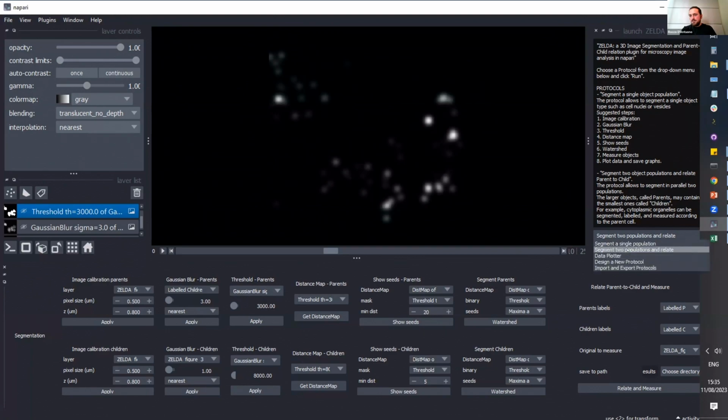So it's not in the basic protocol here, but if you click here and choose the option to design a new protocol, it will bring you to another part of the interface. I just want to answer the following question, and after I will do it, because of the size of the screen, I'll need to close this one or put it to float if you want to see it. Okay, yeah, thanks. And are there any other questions that I missed, Tobias? No, I haven't seen any other one.